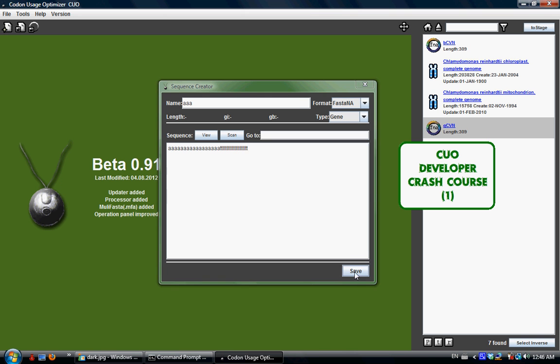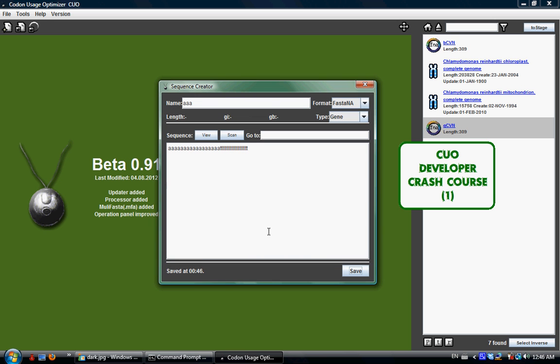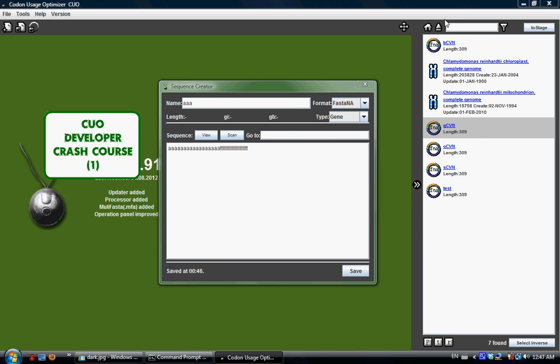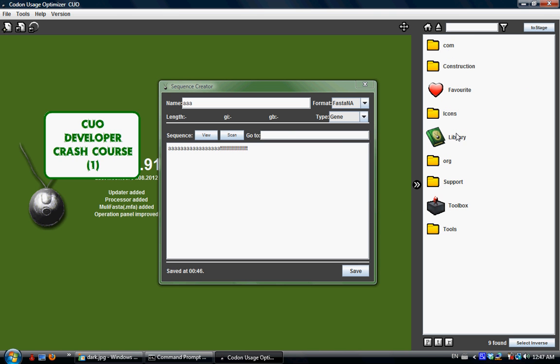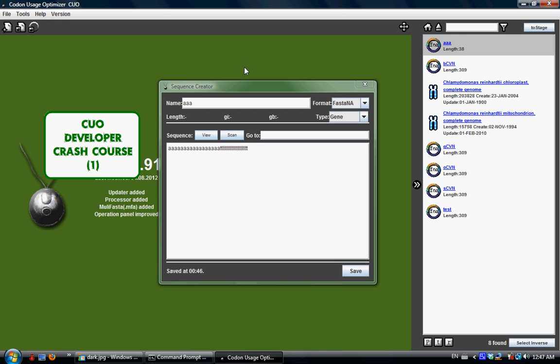Once you're happy with it just click save and it will save in the library directory here. Suddenly a label here will pop up called 'save at' with the time, which indicates your save is successful and the time that you have successfully saved the files. If you try to go up a level and come back again, it's not going to automatically refresh but we can work it out later. You can see the AAA I created here right now as an FNA file.